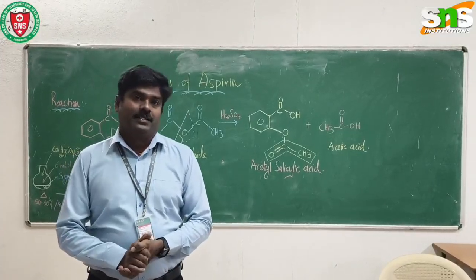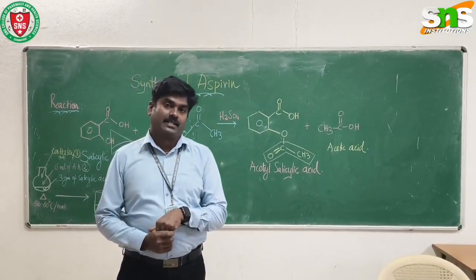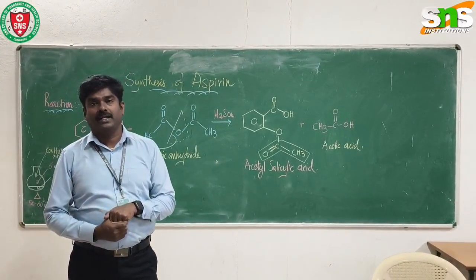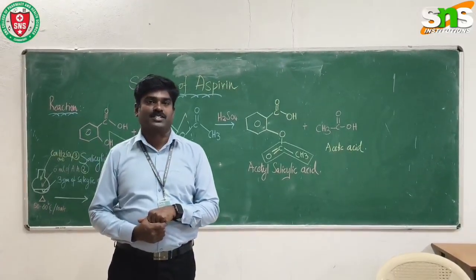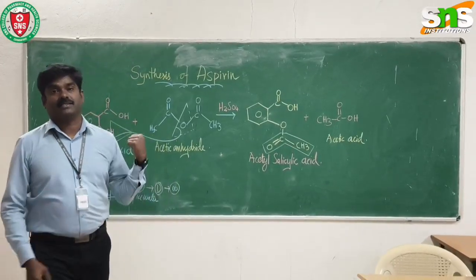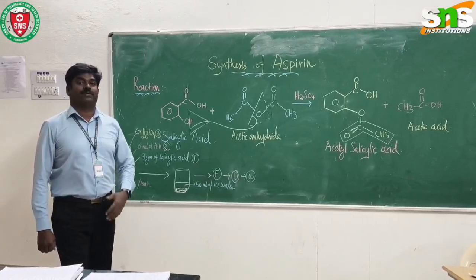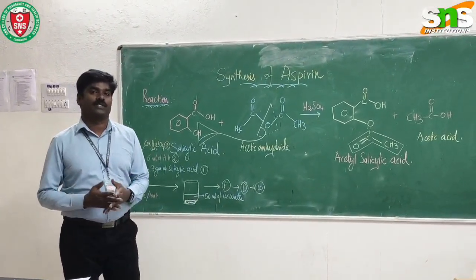I am working as an associate professor at SNS College of Pharmacy and Health Sciences. I am handling the POC 1, Pharmaceutical Organic Chemistry 1 practical. Today we are going to learn the synthesis of aspirin. The synthesis of acetylsalicylic acid is a very simple preparation.